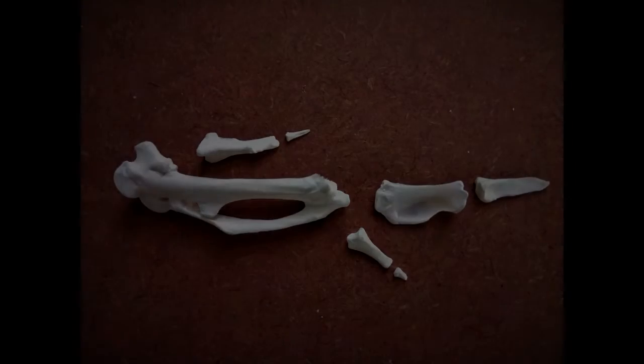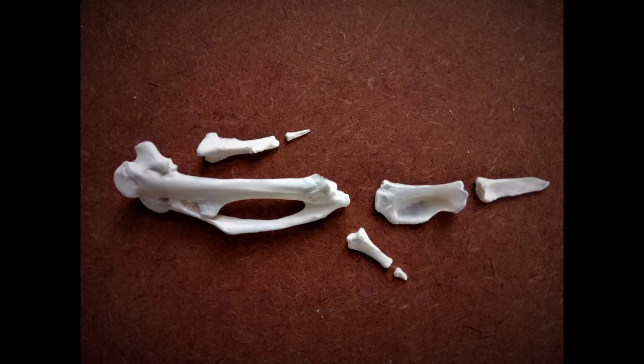Let's begin the wing articulation with the carpometacarpus and the phalanges and work our way down. I'll be showing you the articulation steps for the right wing. Here's a close-up of the arrangement pattern for the carpometacarpus and the phalanges. Nothing much to be explained here, so I'll just let the video do the talking.